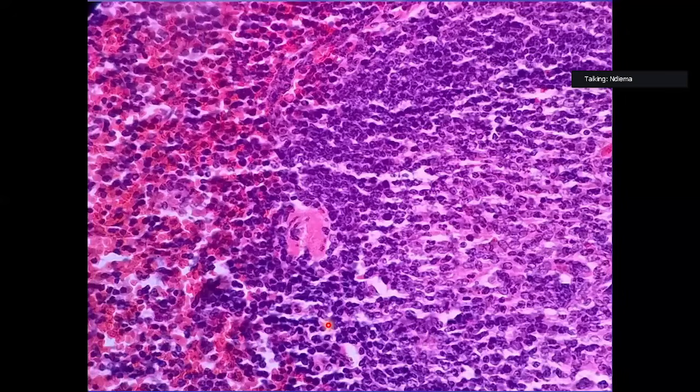This is a splenic nodule. This is the germinal center. This is the central arteriole, which we have said is eccentric. This is the cap or the mantle. And this is the marginal zone. So it is in this marginal zone that we have the activation. It's also in this marginal zone that we have the cells migrating back now into circulation. The mature cells, the plasma cells, can migrate into circulation in this particular area.